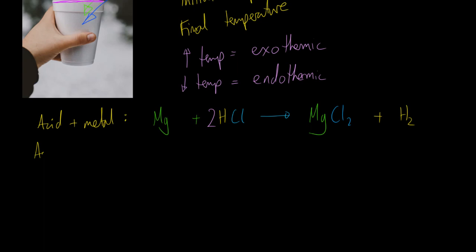Acid and carbonates, perhaps. Something like calcium carbonate, CaCO3, plus something like sulfuric acid, H2SO4, something like that.